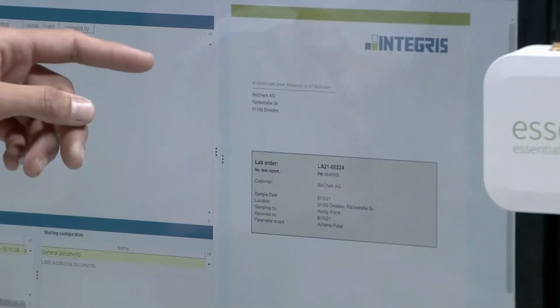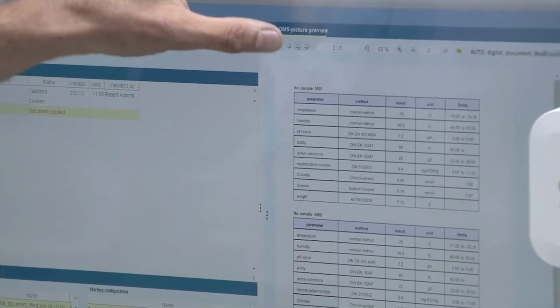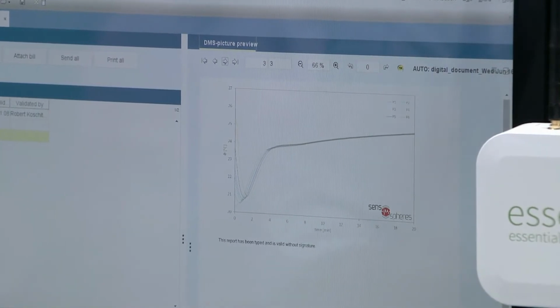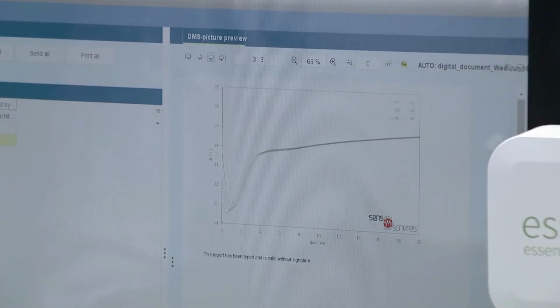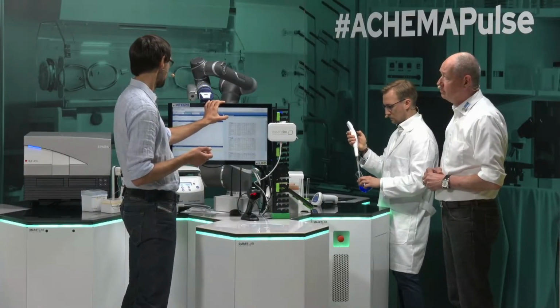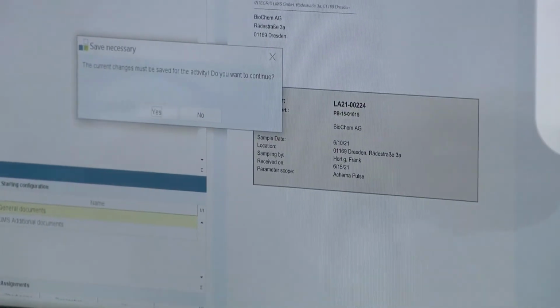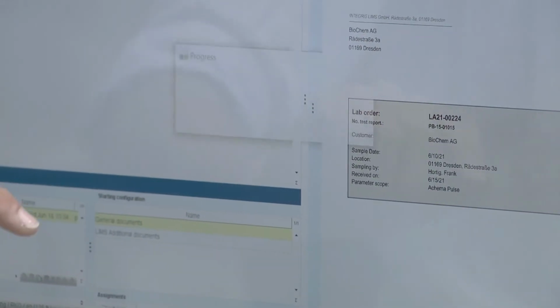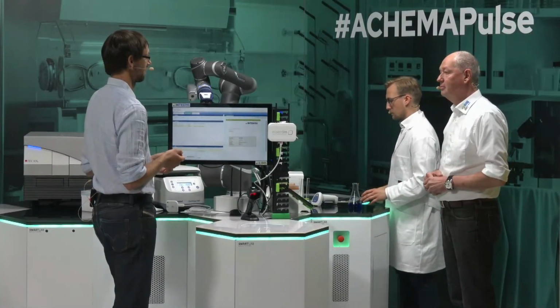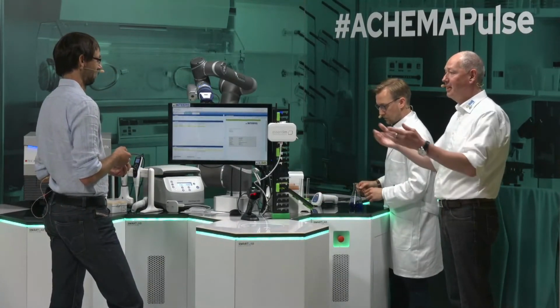So here we have the report on the right side with all the customer information, and we have the measurements we have done, and we have, of course, the raw data. In our case, it's the Sens-o-Sphere data. And what we have to do now is to check the plausibility and the completeness of the report, and I think it looks pretty good. So I would validate the report, and after this, confirm. We could send the report to the customer or to the authorities if needed. Indeed, it's looking pretty good. I am deeply impressed about the productivity of the whole system. Thank you very much. Thank you.